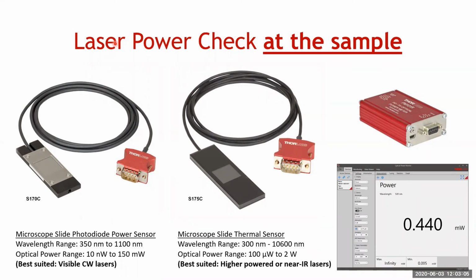We make sure that we have system engineers come in and align everything as best we can. But if your experiment is very crucial in terms of the power that you put down, then you want to make sure that at the very least the laser power you're getting at the sample is exactly what you have from the beginning and end of your experiment, especially if you come in over several months.